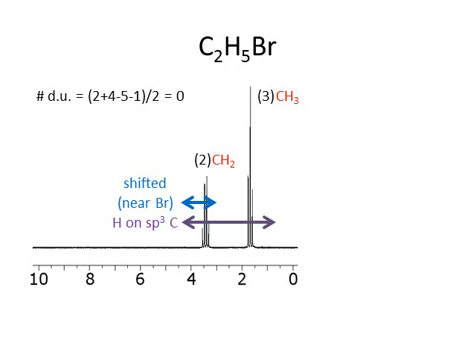Instead of having a CH2, I might have 2 identical CHs. And instead of having a CH3, I might have 3 identical CHs, that is, related by symmetry. But in this particular molecule, I've only got 2 carbons to work with, so it's not like I could have 5 different CHs to account for. So be a little bit careful with that, but it's usually going to be pretty straightforward. If I integrate for 2, that's probably a CH2.